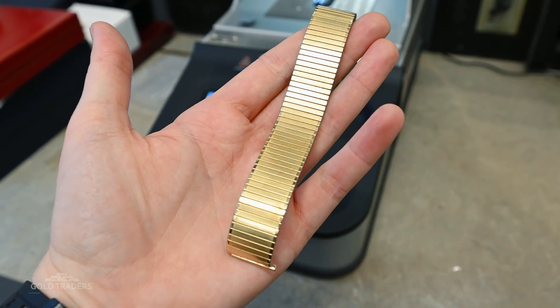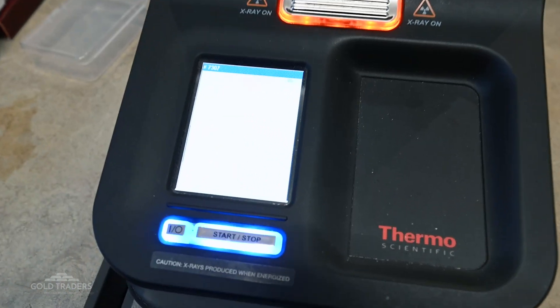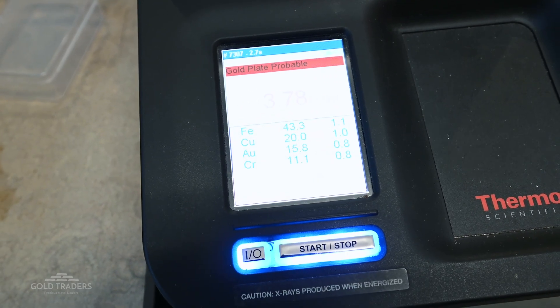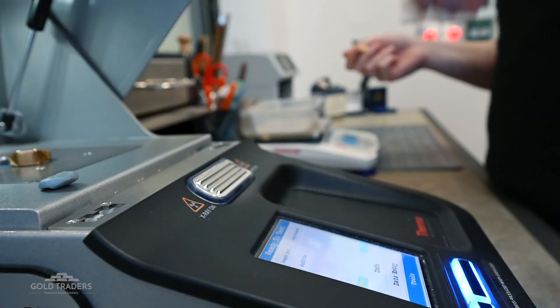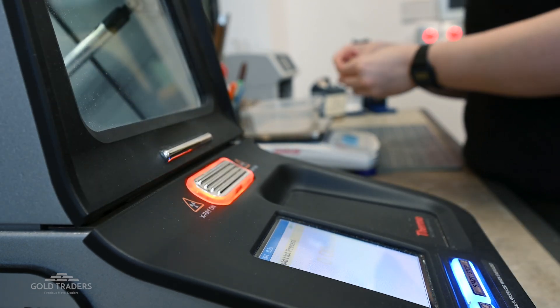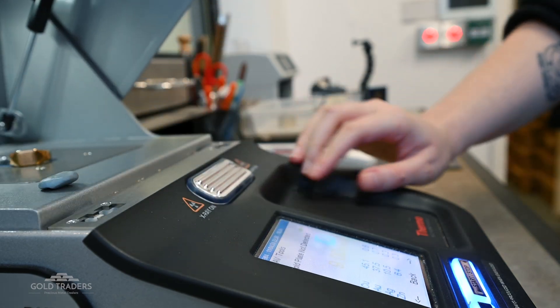This is important to us because even though our name is Gold Traders, we do deal in a variety of precious metals and knowing what we have is very important. Whilst our gold counter team are very good at what they do, having the warning about plated items from our particular XRF machine is such a good security feature. Not to mention that it's just plain efficient — the XRF machine is incredibly quick and safe to run whilst we take a look at another item or do some calculations.